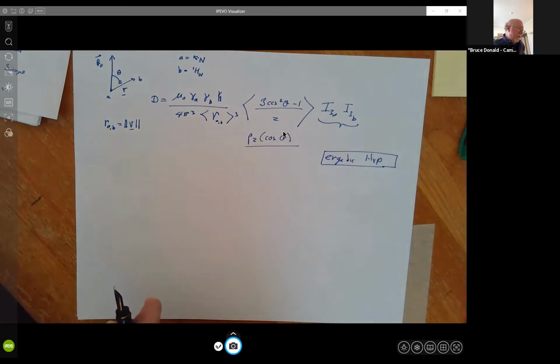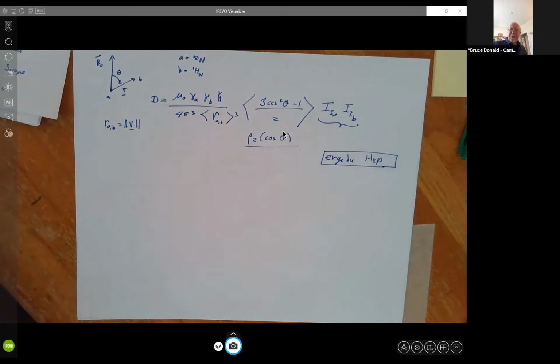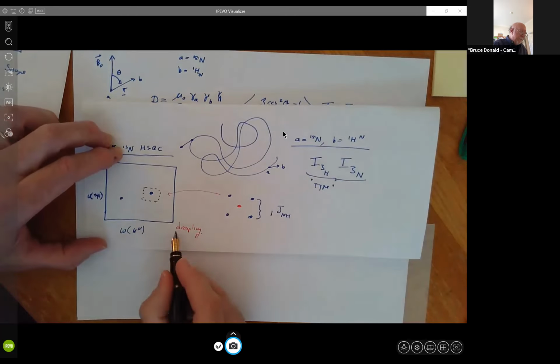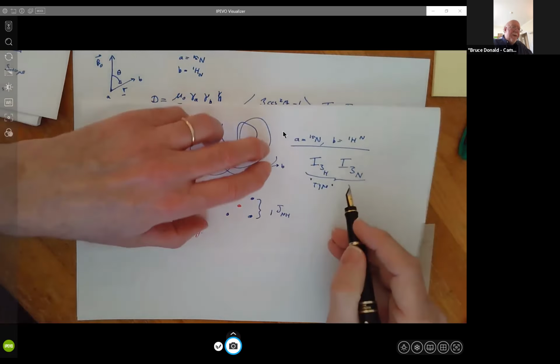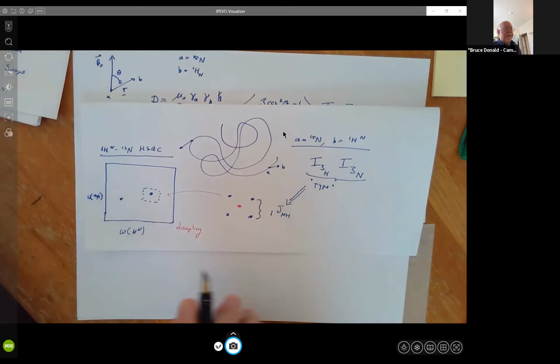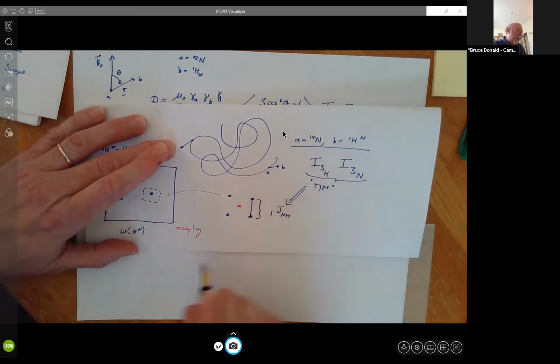Now, let's parse this a little more. What would you actually observe here? Why should we see anything in the HSQC experiment appropriately modified? And the answer is that we really don't in the case where we decouple over here, because we've averaged everything out. But the way this experiment is set up, if you do these manipulations, the splittings are measuring this 1J_NH scalar coupling through one bond. So this difference here is measuring those couplings.